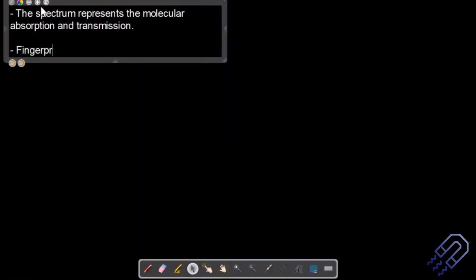In general, what we get from FTIR spectroscopy is a fingerprint of the sample, and a fingerprint is unique to a sample. Every time you take tin oxide, or every time you take a polymer, the FTIR that you get is going to be similar. The position of the peak will be the same. The intensity might be slightly lesser or more depending on how much amount is present, but the peak position won't change.